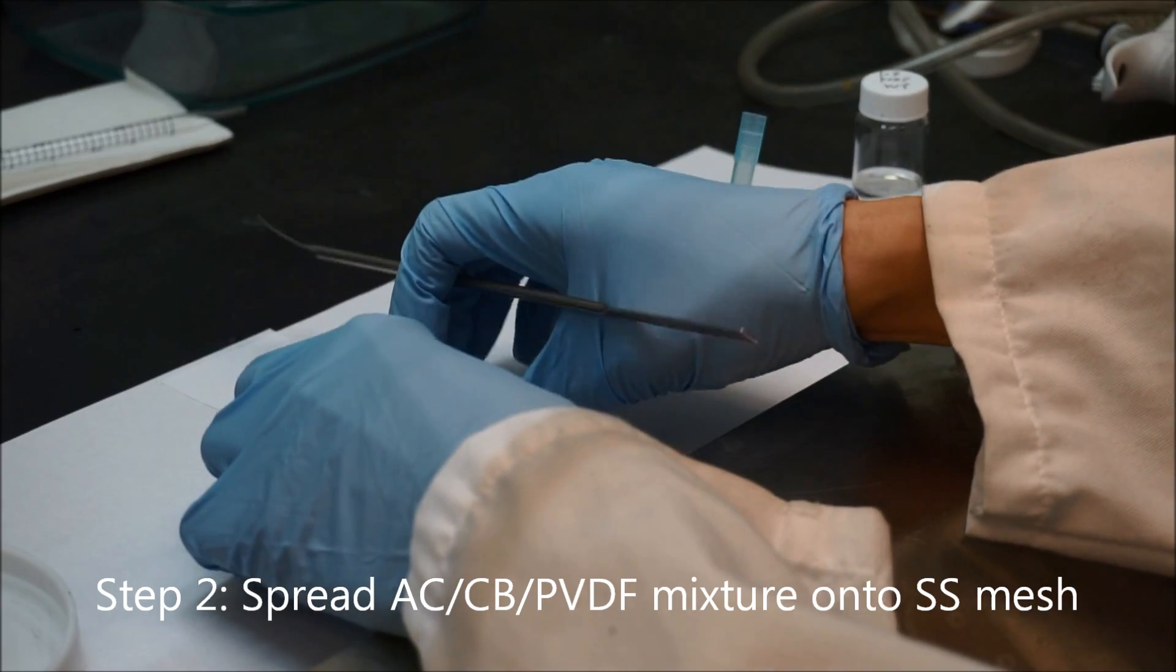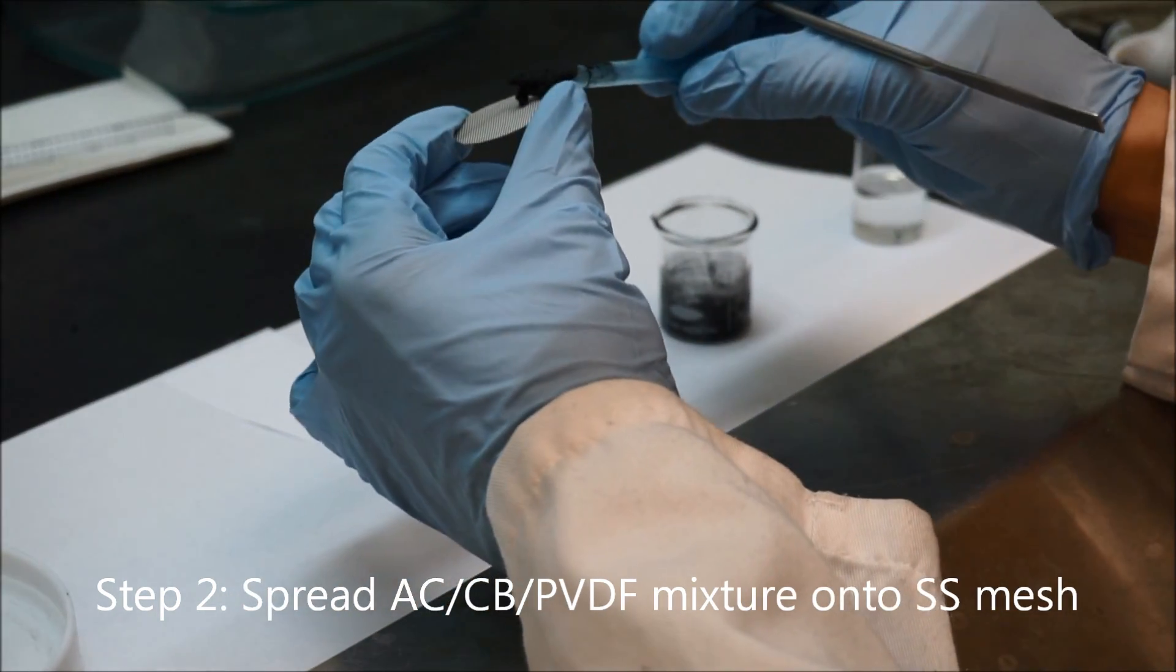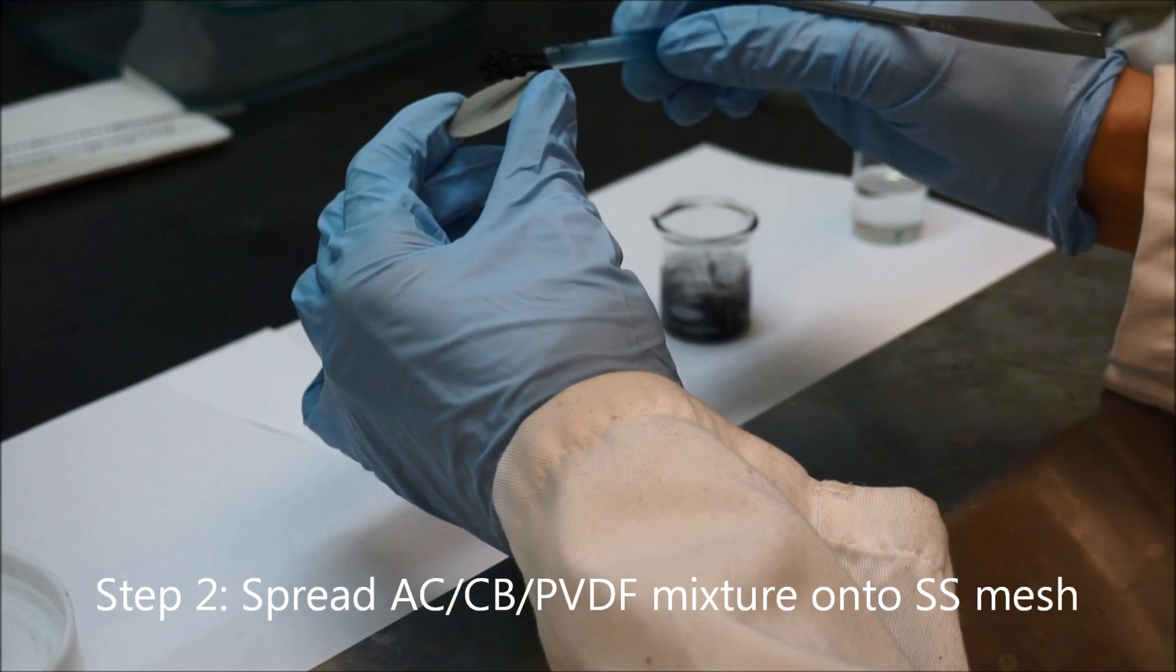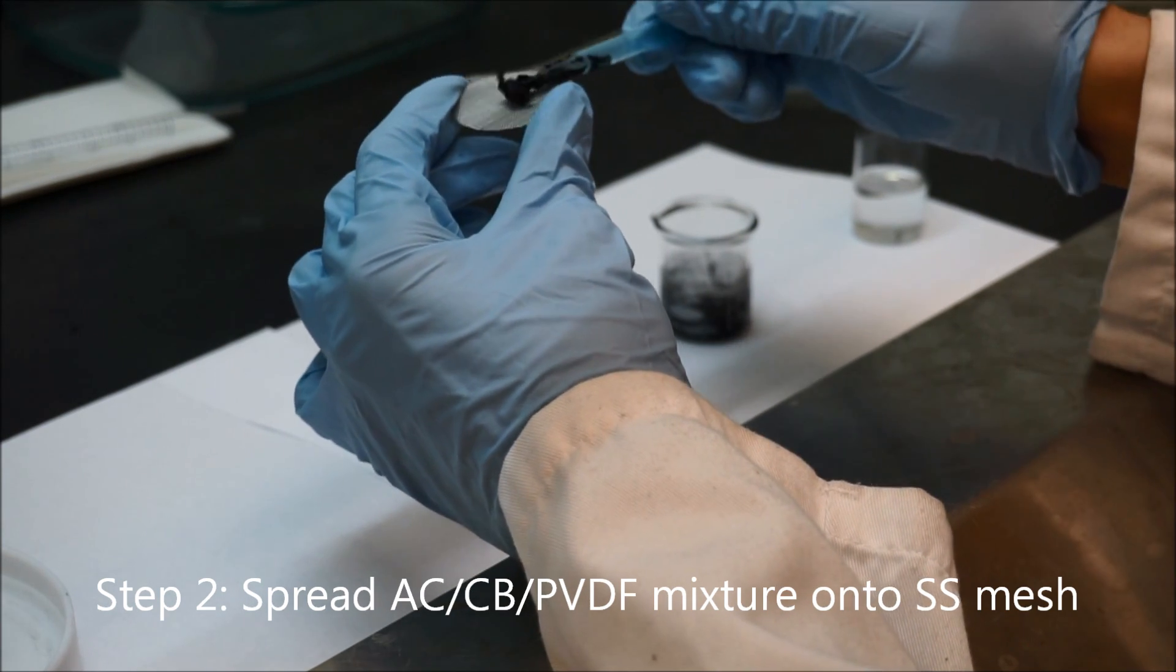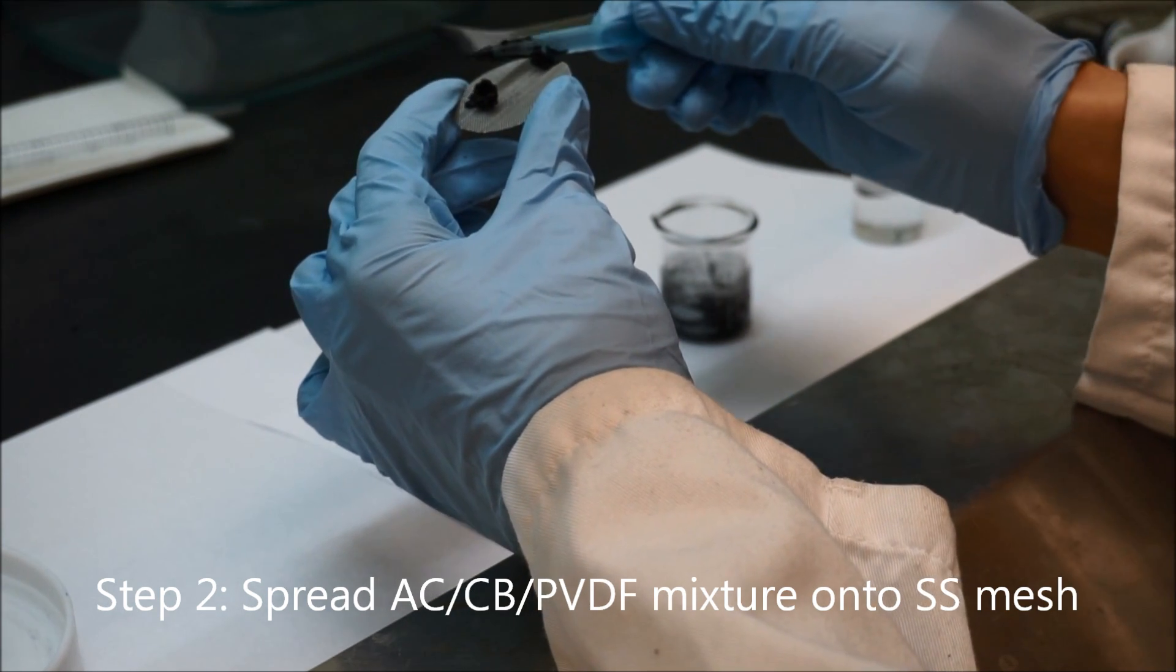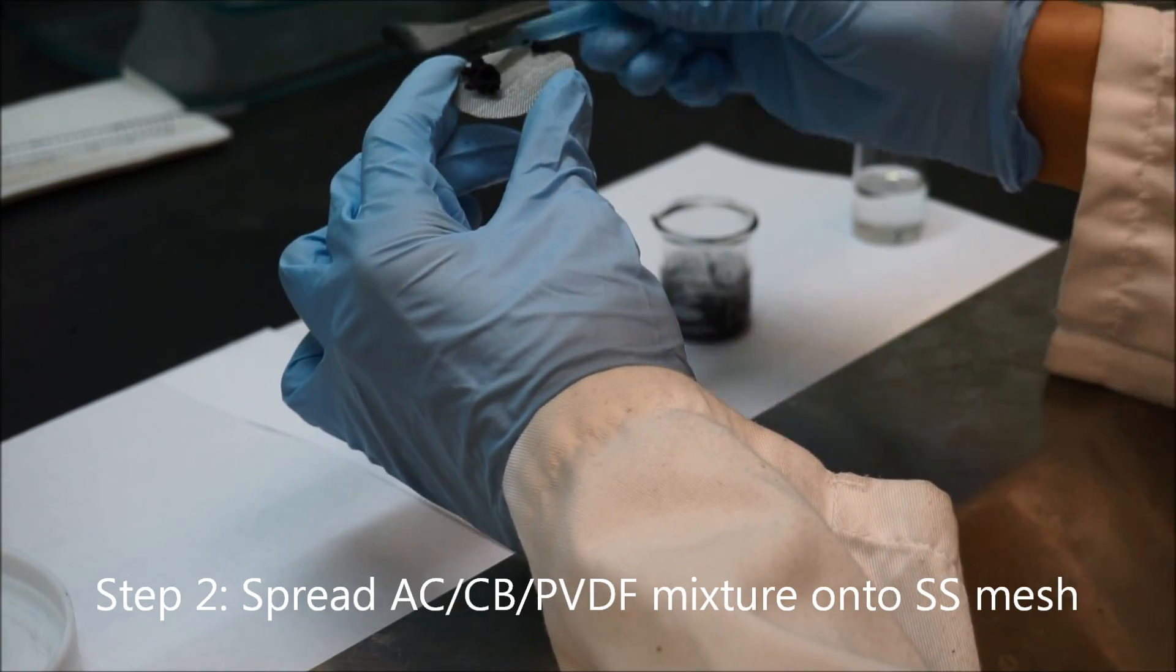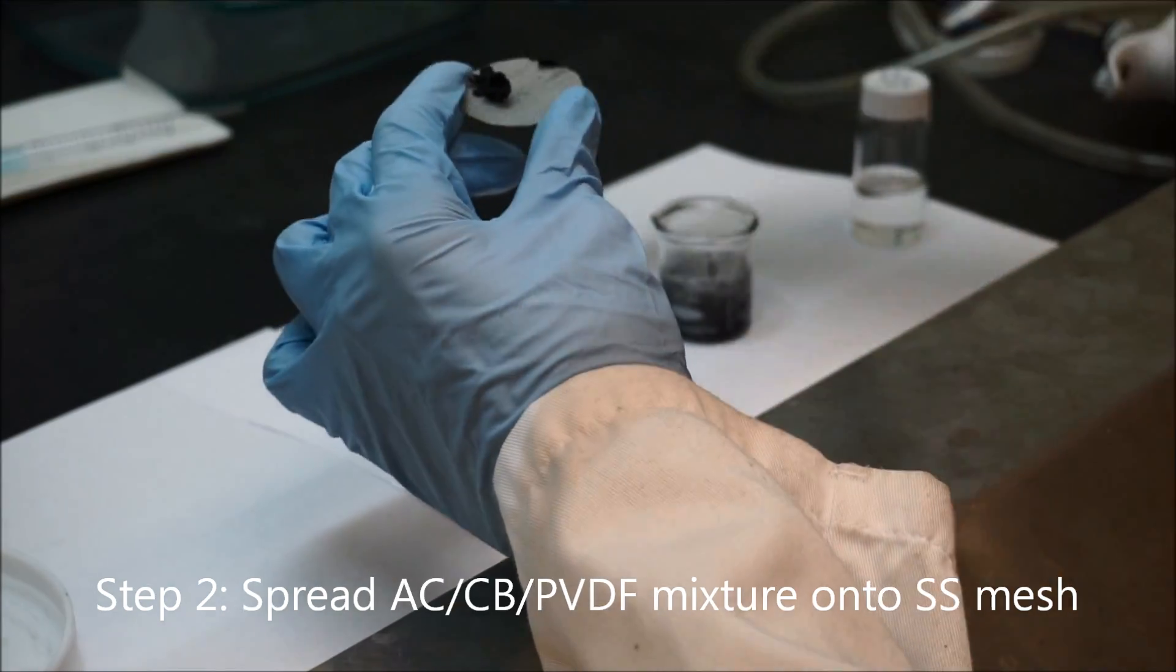Then the second step is to spread the active carbon, carbon black, PVDF mixture onto the stainless steel mesh. Here we use a spoon to quicken this process.